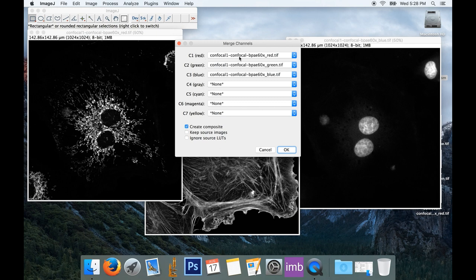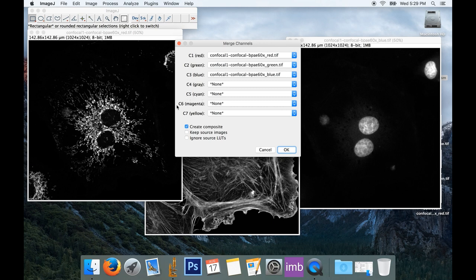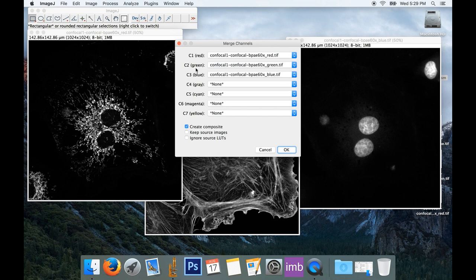Now the first channel is red, the second channel is green, the third channel is blue, but you'll notice we've got four more channels. We've got gray, and then we've got cyan, magenta, and yellow. I just want to make sure that my red image is assigned to my red channel, my green image is assigned to my green channel, and my blue image is assigned to my blue channel.